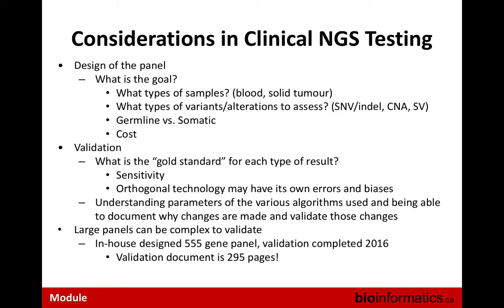So there's many callers, many of these variant callers we've been talking about, or even the GATK when you're processing the BAM, they have a million different arguments that you could use. You could tweak a million different things. How do you know which one to do? So you really can't. You can't change them all. You can't effectively test them all. We don't have a good enough known data set to be able to just run through all the different possibilities and figure out programmatically which is the right one, which would be ideal. So all you can do is start with the recommended, generally used settings and then see what happens to your data if you manipulate a few that make some sense when you read what they're about.